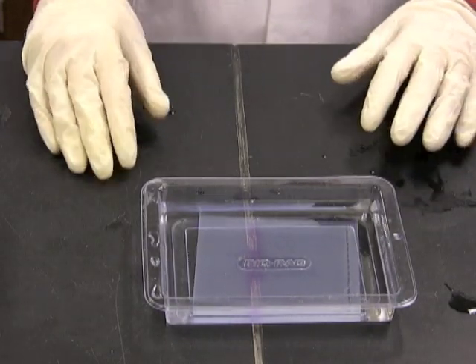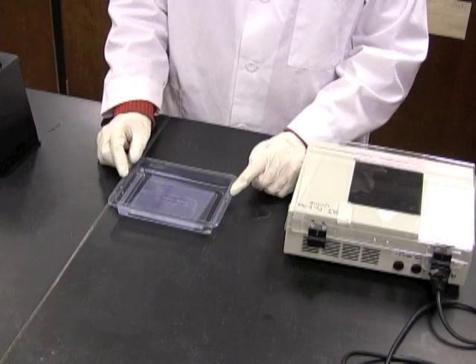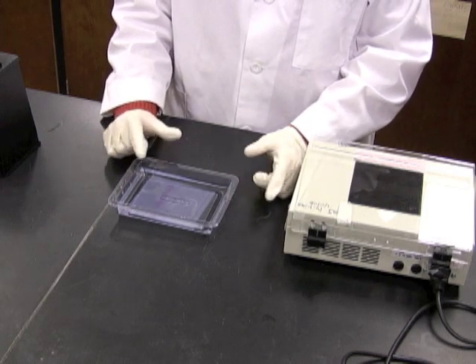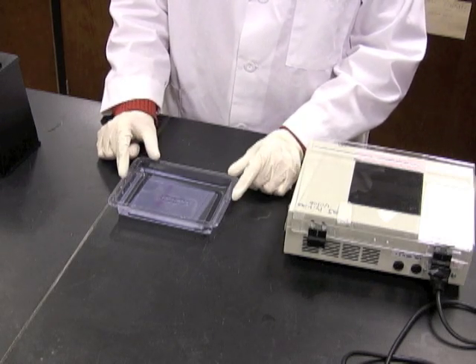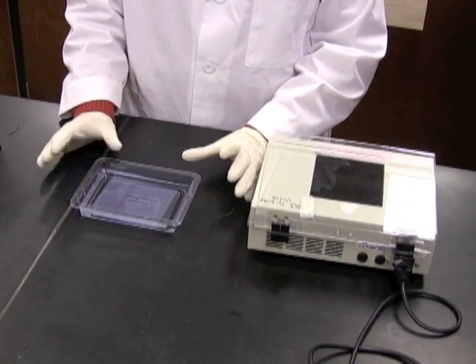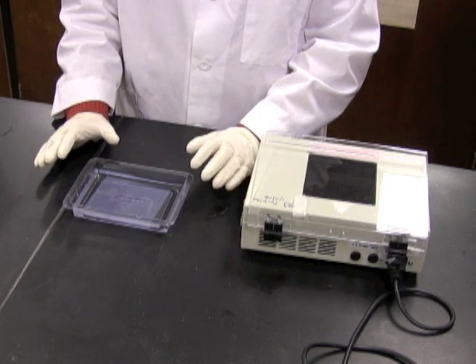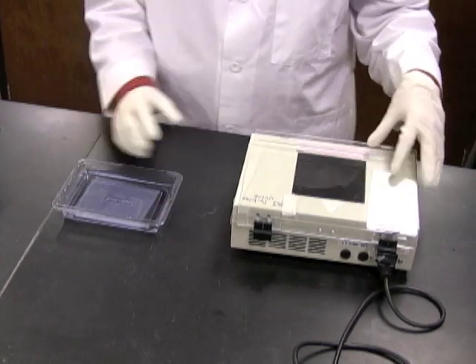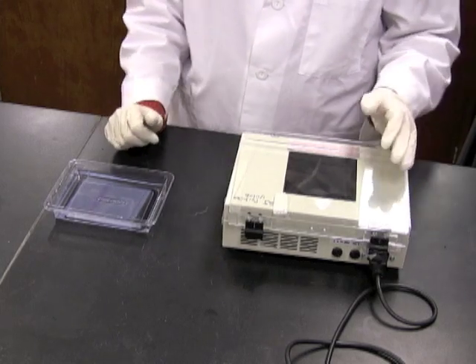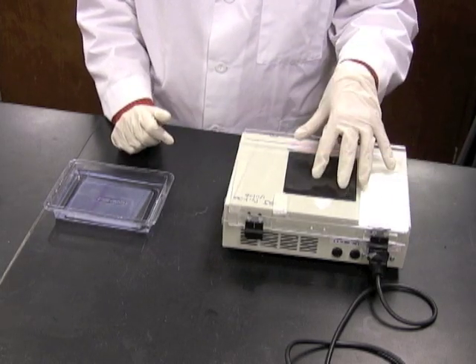This is a UV light box, and now that your gel is done staining, you're going to transfer the gel from the staining tray onto the UV light box. You're using UV light because the stain you use, ethidium bromide, fluoresces when you shine UV light onto it. Now, UV light can actually damage your eyes and also your skin, so you want to make sure to wear goggles and also put the cover back onto the UV light box before you turn it on.